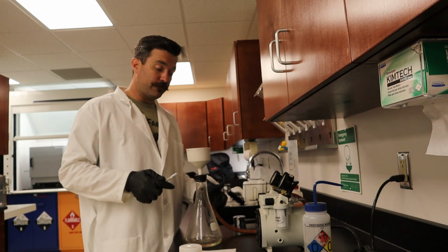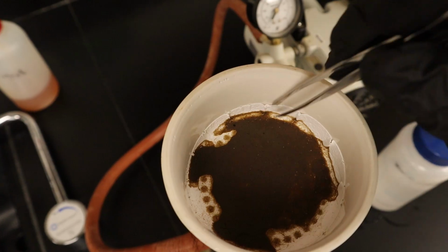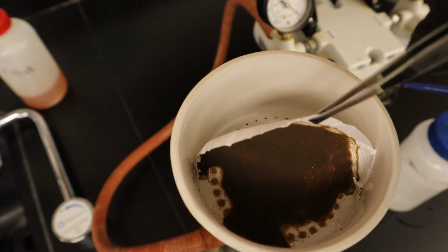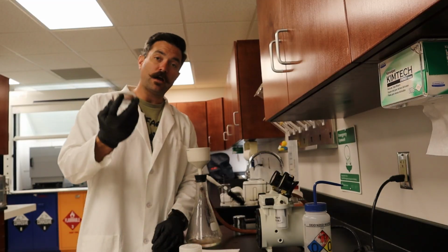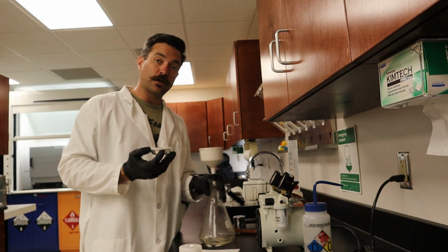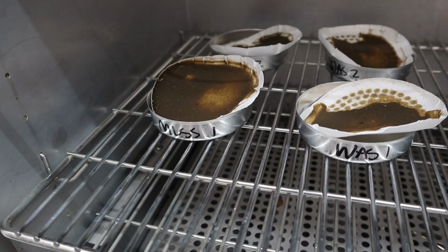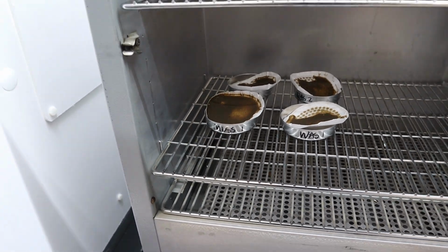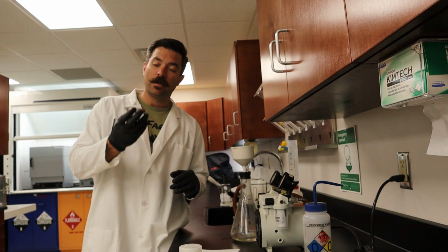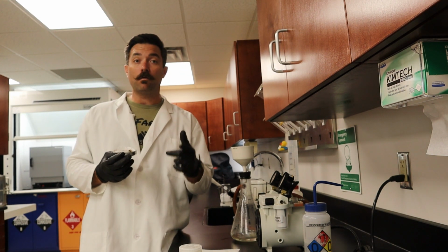Alright, now that we have finished drying off and the dripping has stopped, I'm going to try to pull it off so you can hear that pop. And there we go. Hopefully the microphone picks that up. But now we have our sample. It has been run through the funnel. It is all on the filter. We're going to go over to our lab oven and place it in the oven for exactly 1 hour, maybe a little longer, maybe not exactly, but at the minimum of an hour, so that it has time to dry before taking it out and putting it in our desiccator. We'll be back once we get done with that.